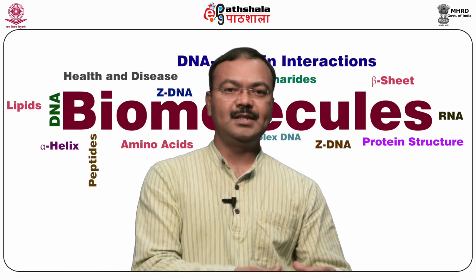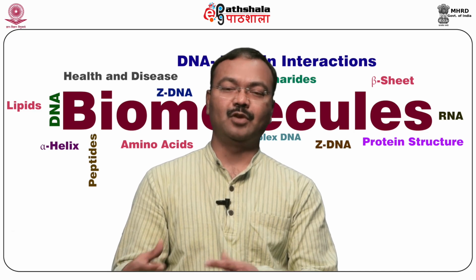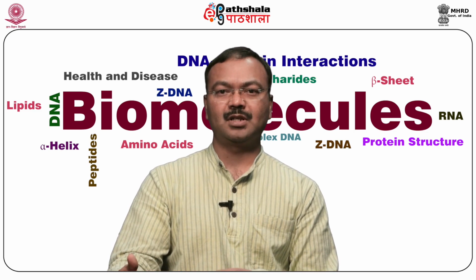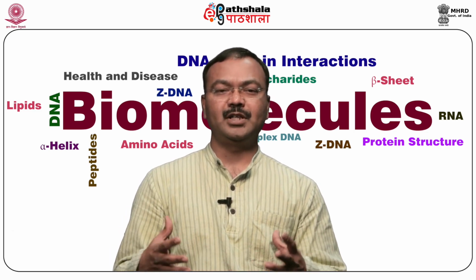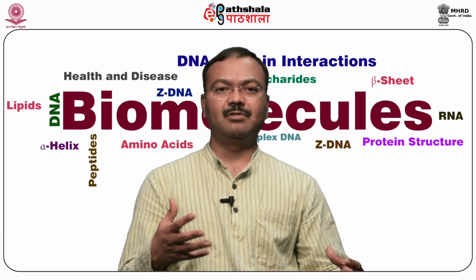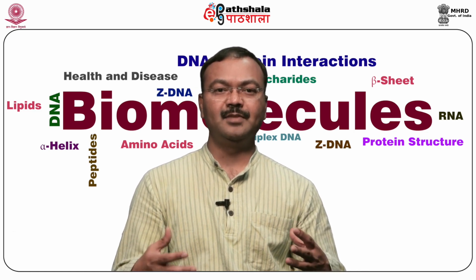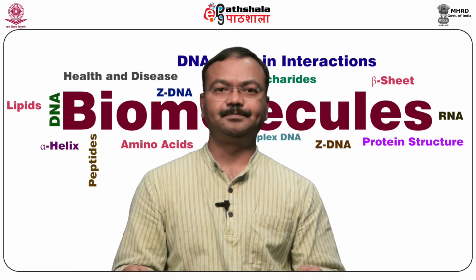So using this method, generally one obtains low resolution information. And of course, as I said, for viruses people have determined structures up to 2 angstrom or less than that. And this method needs large computational power. Of course, now we have much better servers and large computational powers, but still, because of the image reconstruction, it needs large computational power.